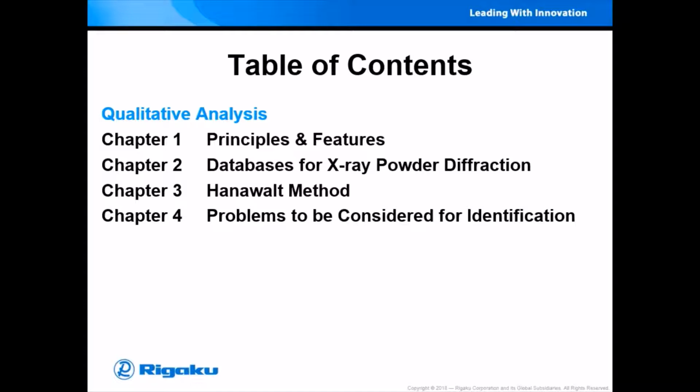The general outline of qualitative analysis of both the Hanawalt method and computer programs are the same, though details such as algorithms, procedures and others are not the same. Lastly, I'll explain some problems to be considered for identification in Chapter 4.